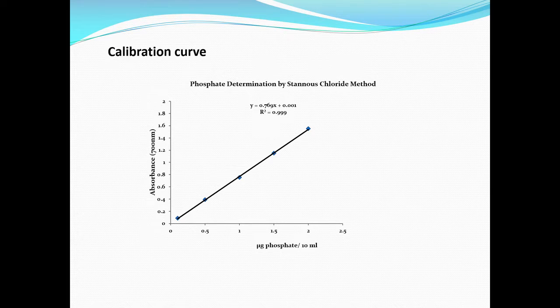And then we have tried a couple of complexing agents, for example glycine, as 1 ml of 0.1 molar glycine we have tried, and in glycine also we found that most of the cobalt, copper etc. they do become turbid, but equal amount of phosphate does not give any interference.